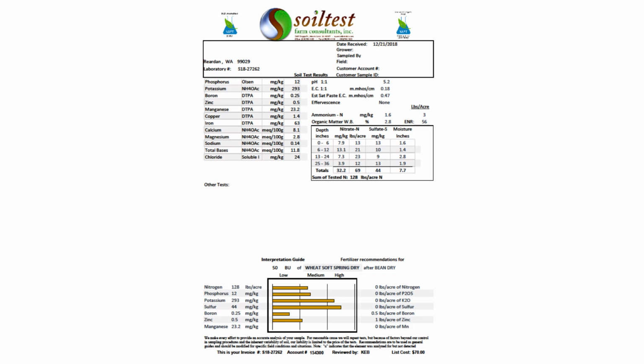Another way that this report is different is that we have now listed chloride. Chloride is an extraction that is done with water and is often of interest for wheat growers in arid conditions and in non-irrigated dryland conditions.